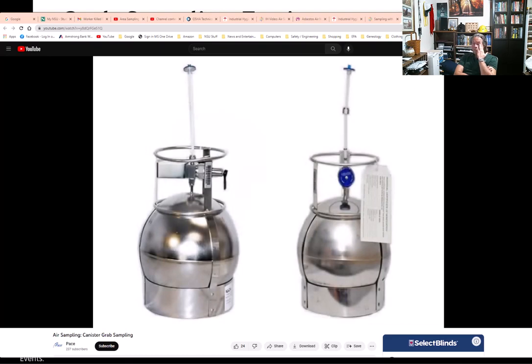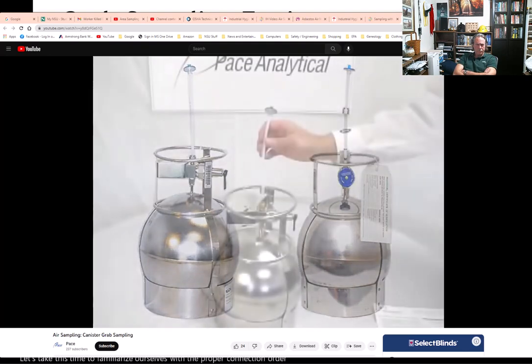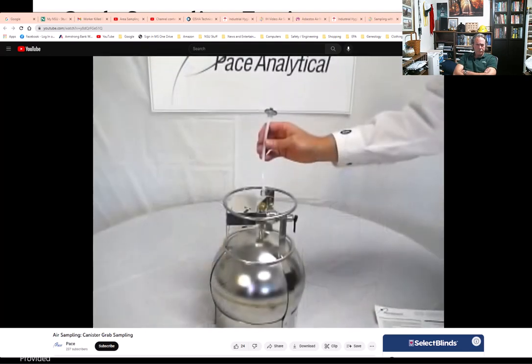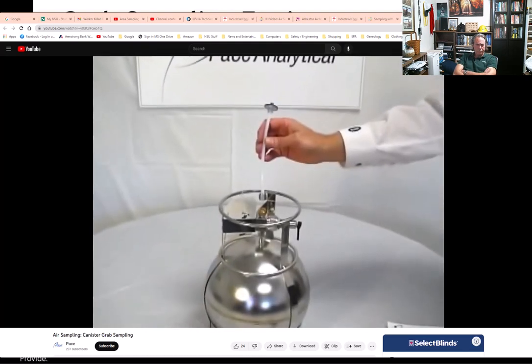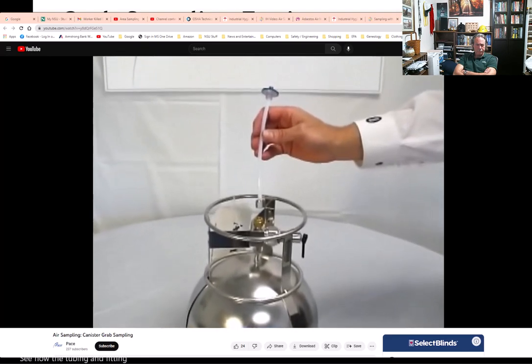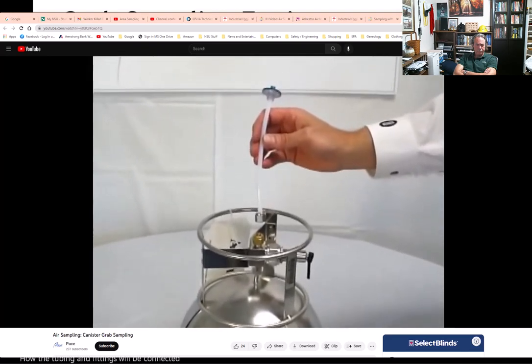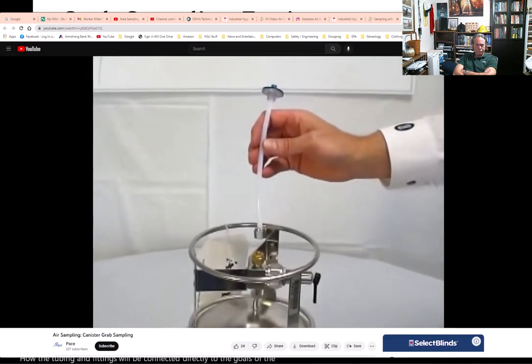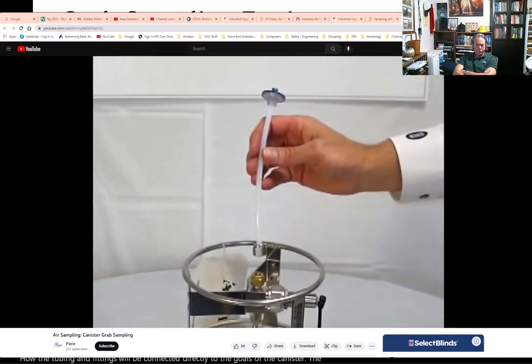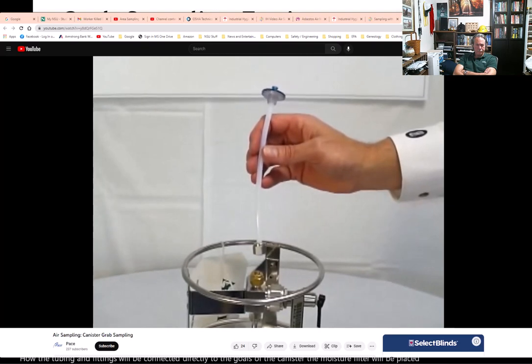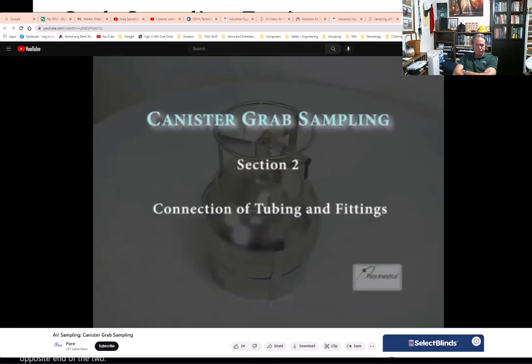Before learning how to make the connections, let's familiarize ourselves with the proper connection order of the equipment provided. The tubing and fittings will be connected directly to the valve of the canister, and the moisture filter will be placed at the opposite end of the tube.